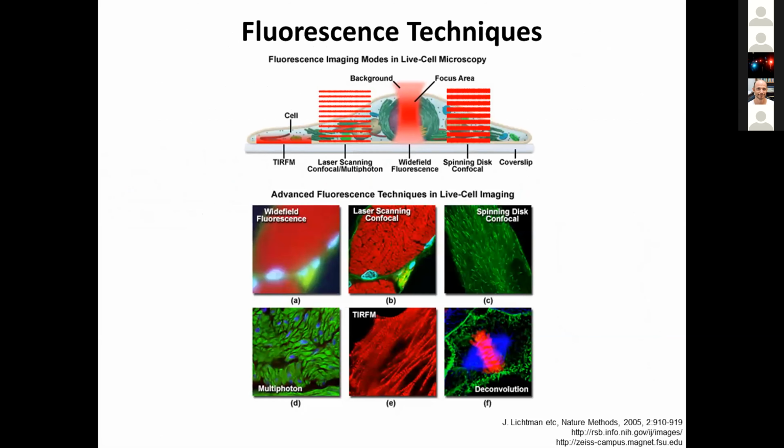But the good thing about fluorescence is that we can use different approaches like wide field fluorescence, in which we focus the light within the optics. Unfortunately, this has a lot of out of focus fluorescence, and this is how it looks, for example, when we do wide field fluorescence. In comparison, the confocal microscope will reject the out of focus light, and we will see how in a minute. And this is important because we can cover different regions in the cell with z-stack resolution.